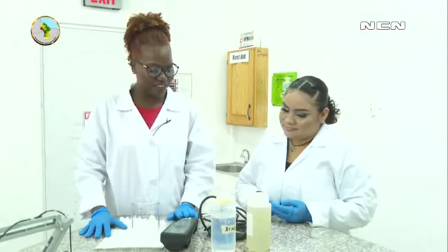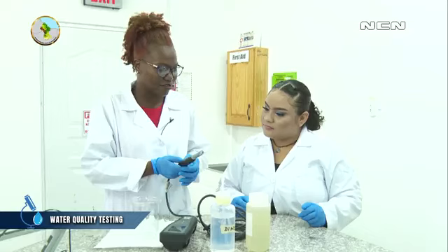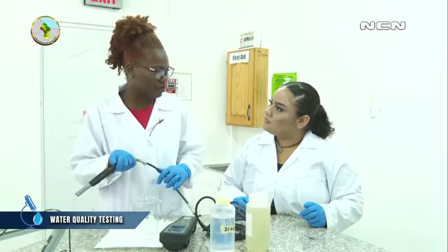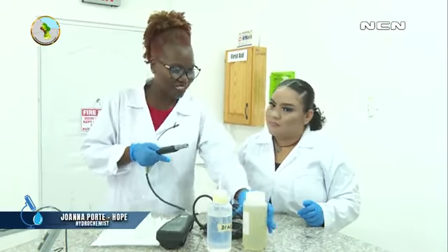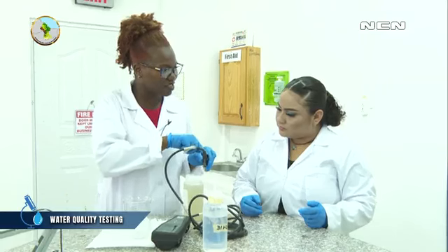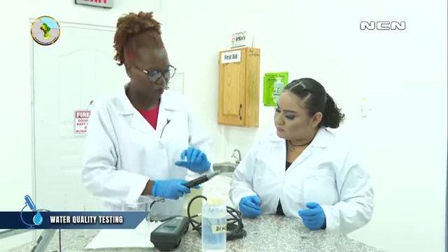So the meter we have here is a Pro 1030, and it's a YSI. This is a field meter, right? We would usually just take this into the field, like if we're testing rivers or conservancies, and it usually has a protective guard on it, and we would just throw this directly into the water and get our pH. But since we've brought our sample back, we can place it directly into the sample bottle to test the pH. You have to ensure that the water sample comes all the way up to the top to cover these 2 holes, so that you can get a proper reading.